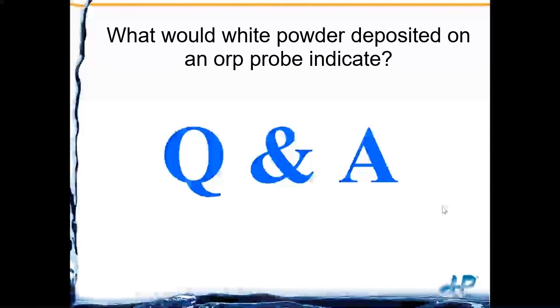Question: what would white powder deposited on an ORP probe indicate? Need more information on where the white powder is. If you take the wet boot off a combination electrode and see white powder on the probe body, that's most likely the internal KCl salt solution that has dried out and crystallized.